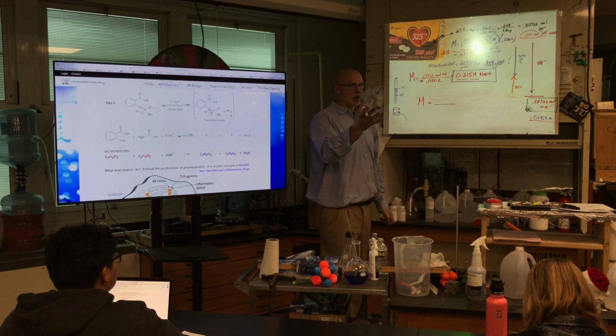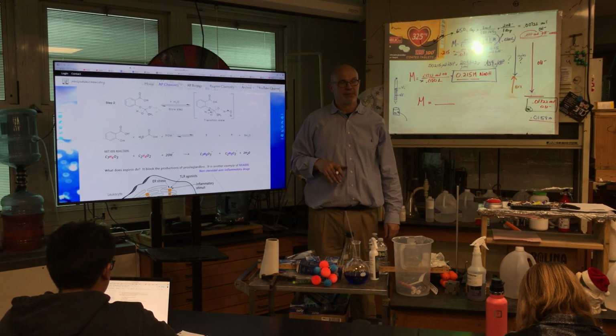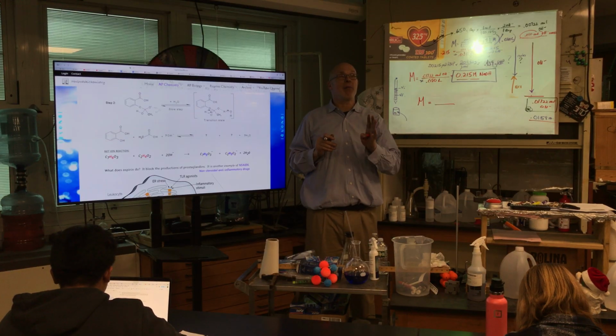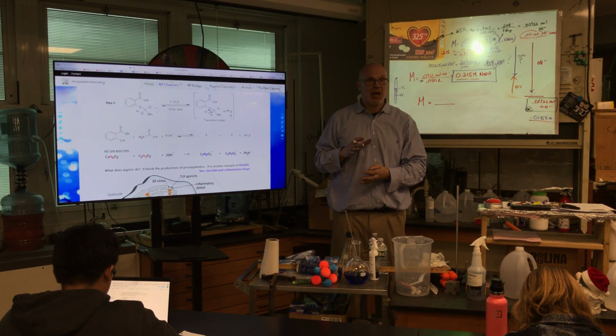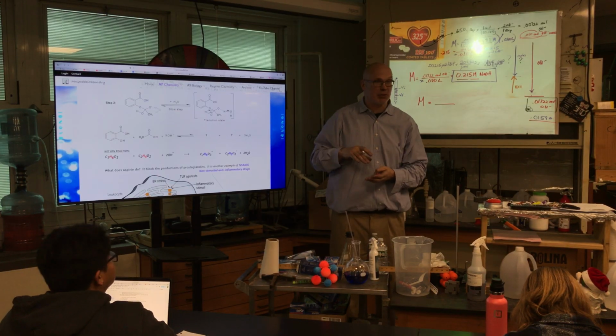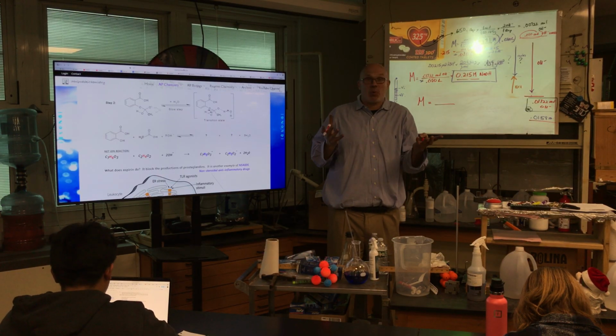Okay, here's an arbitrary value. How much do you want to put in your burette? What's the neutral? We did 20 milliliters last time. How much do you want to add till you get to the neutralization point? I'm gonna say 20 milliliters.